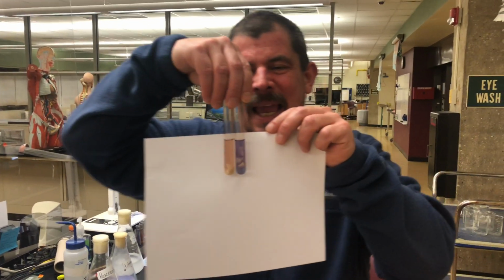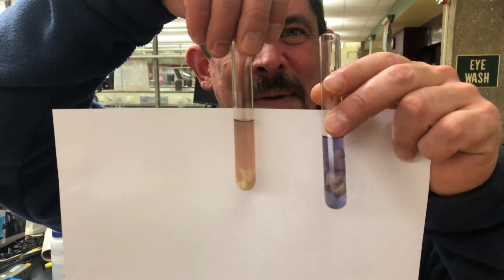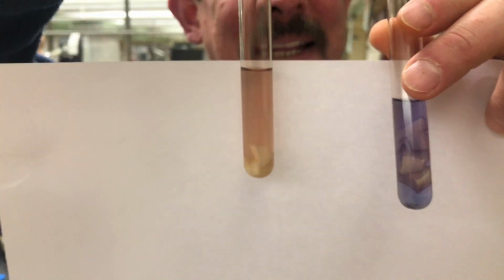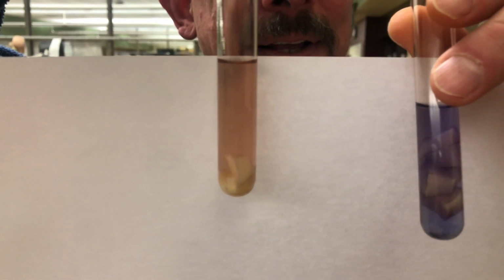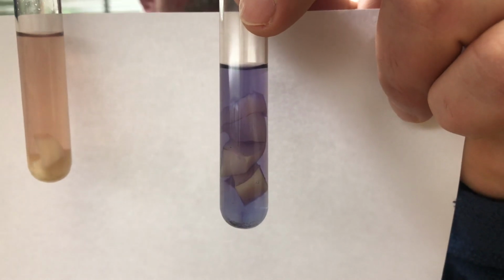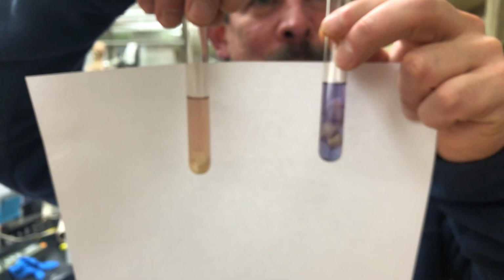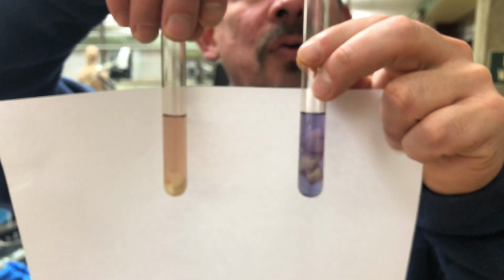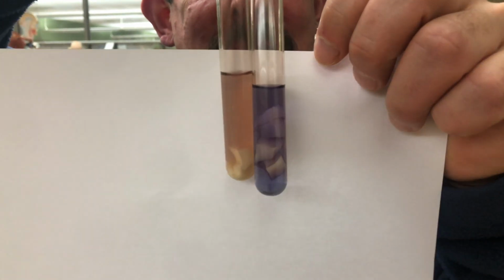And so what we have here, this test tube on the right, you can see the pinkish color. That's an indication that protein digestion has occurred. And in the test tube that has purple only in there, it's an indication that protein is present. So the purple also indicates that no protein digestion has occurred. So when we compare those back to back, you can see the difference between pink and purple.